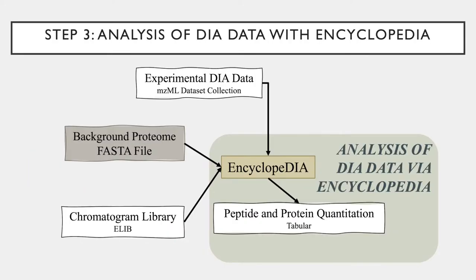The last step of the workflow is the Encyclopedia step and the analysis of the experimental DIA data. This step uses the chromatogram library, the background FASTA file, and the .mzml experimental dataset as inputs.